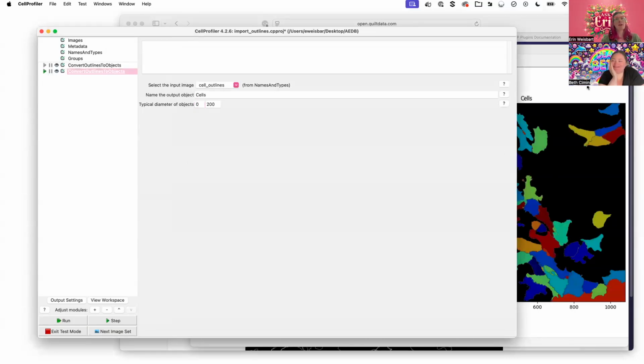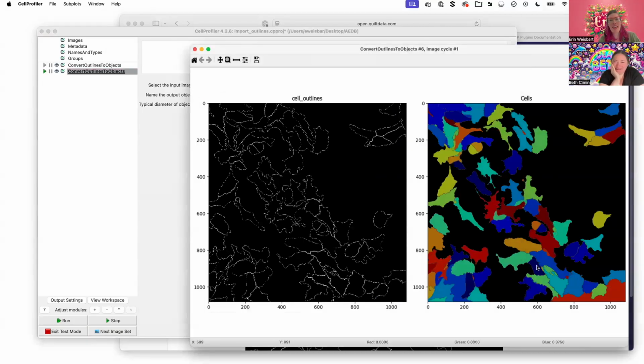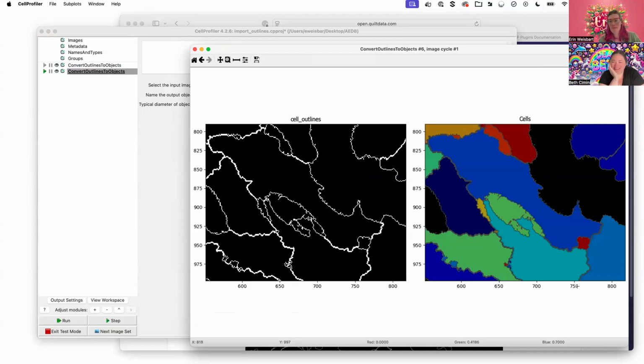Yeah, I pressed O instead of 0. CellProfiler shouldn't allow you to put the letter O in there. Somebody would fix that. Oh, maybe I'll go file a bug report.